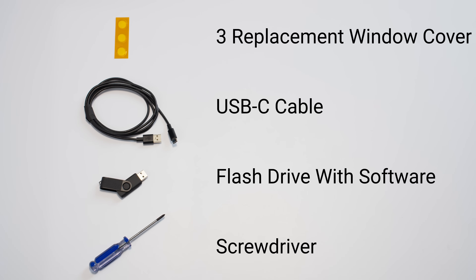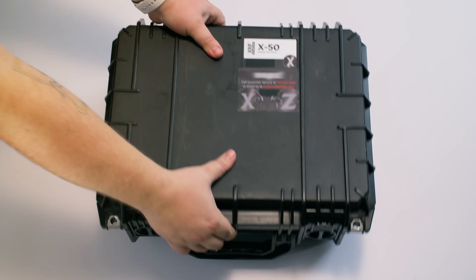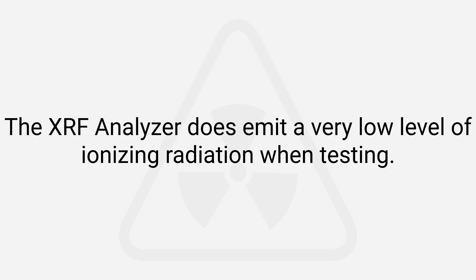Everything comes neatly packed in a carrying case, so you can take it anywhere. Now before we go further, let's quickly cover safety — the XRF analyzer does emit a very low level of ionizing radiation when testing.